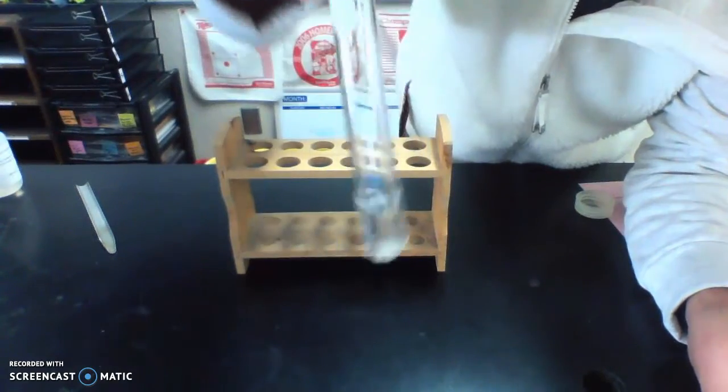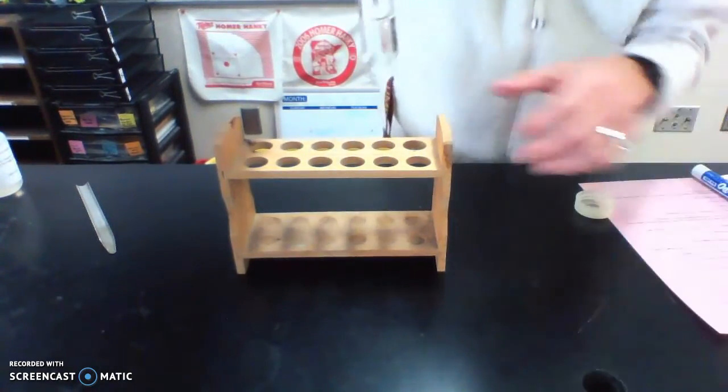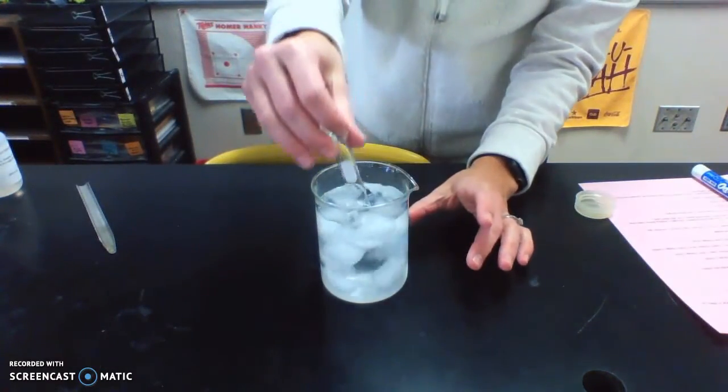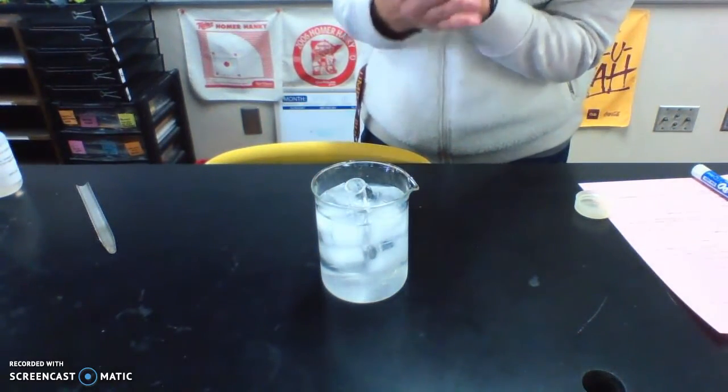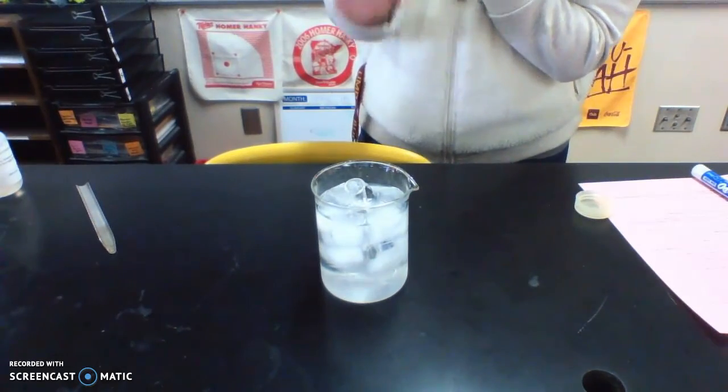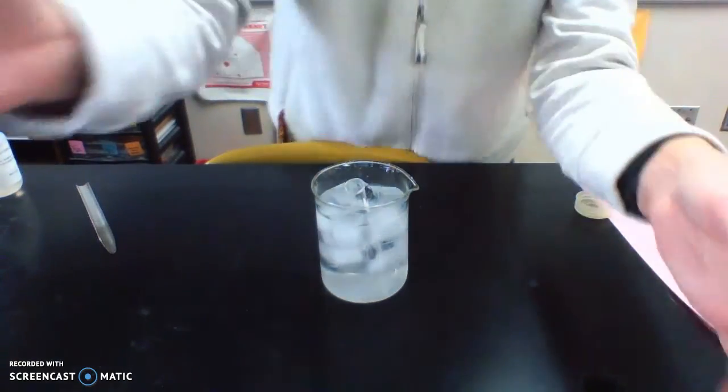All right. So we've got a little bit of potassium nitrate in there. The rest of it is the potassium nitrate solution. So I'm going to put it in an ice bath, and it's going to cool off. In another video, I will show you the results of this, and we will talk more about the equation.